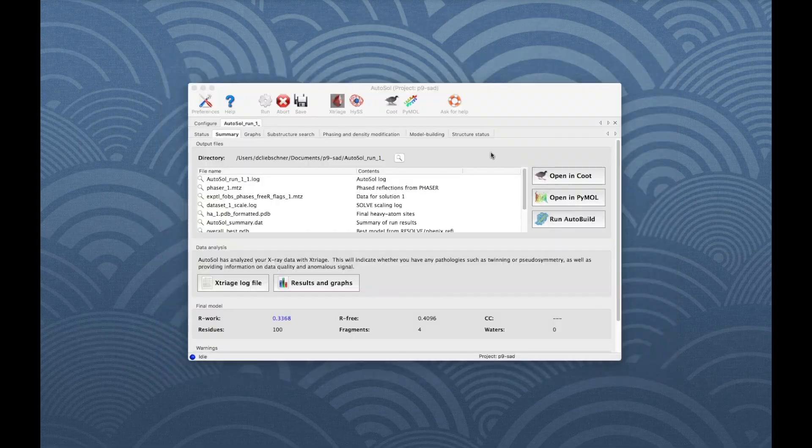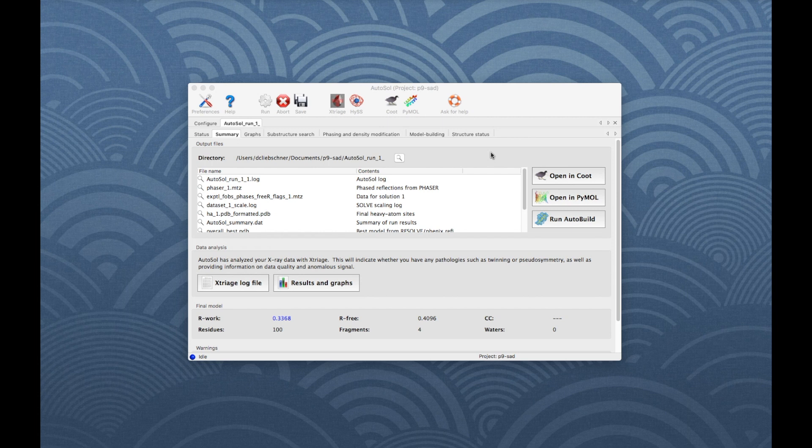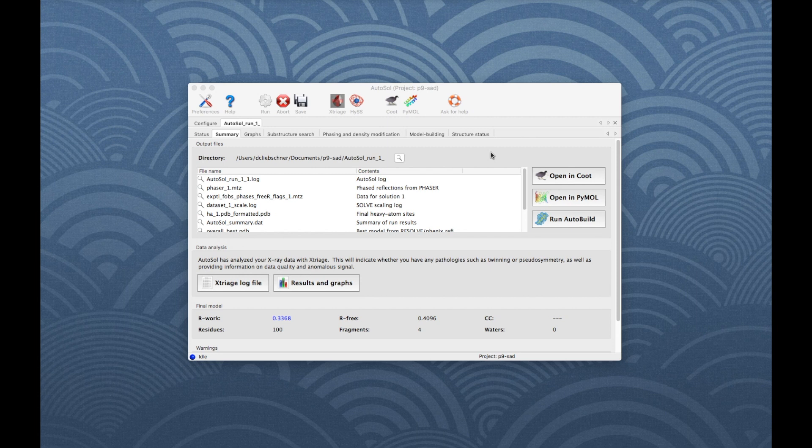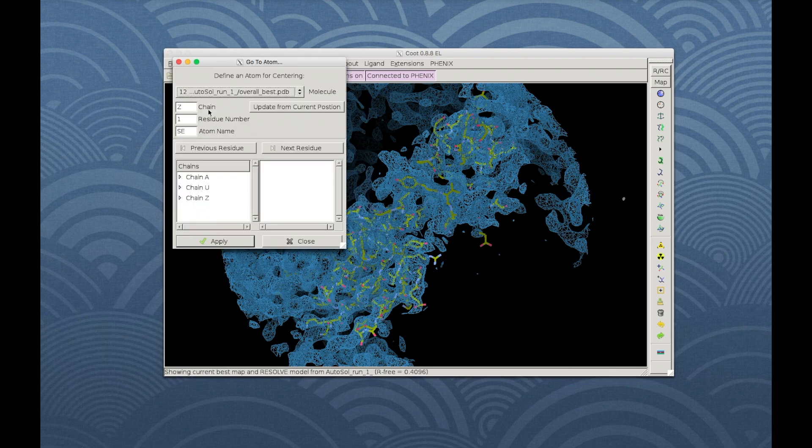The Summary tab shows final statistics and output files. The correct solution in this case is unambiguous based on visual inspection, the refinement R-factors and the correlation coefficient. To open the model and final map, click Open in Coot. Select the first atom in chain A to center on the molecule.